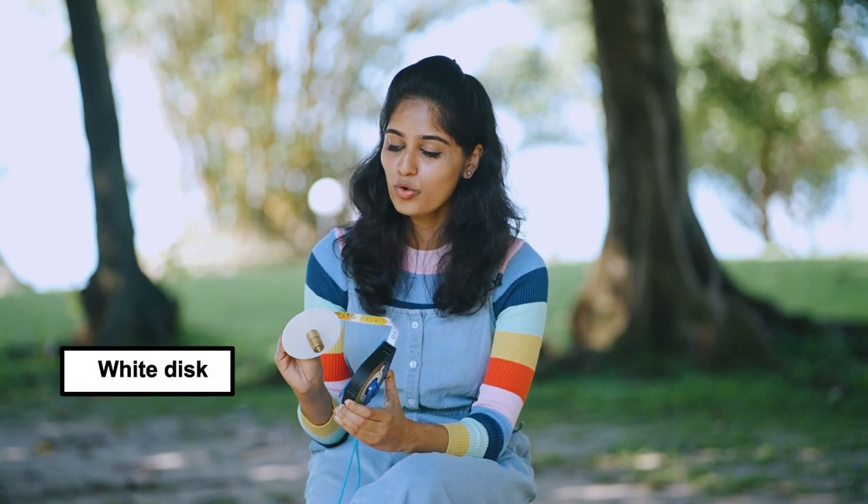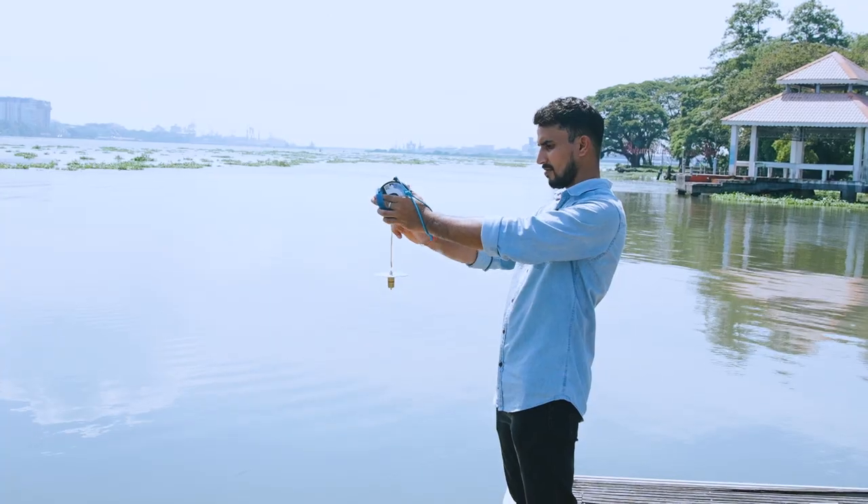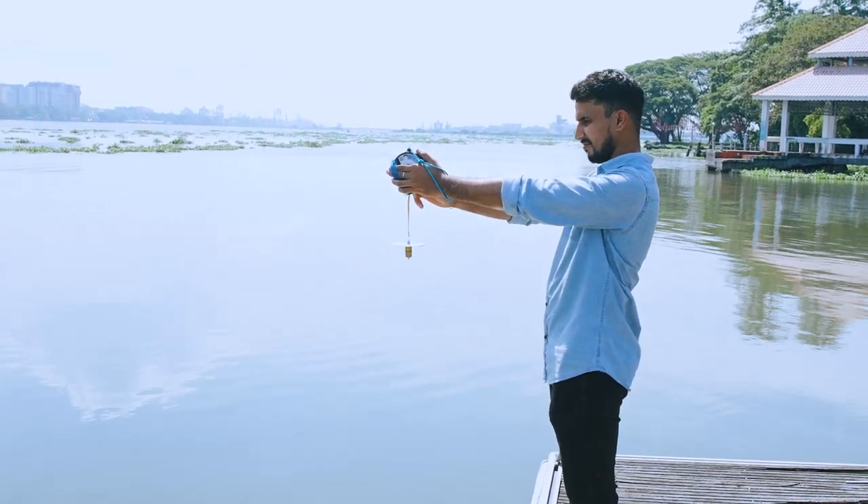The mini circuit disc has a white disc that is lowered into the water. The depth at which it disappears and reappears is locked in to find the Secchi depth, and this depth is proportional to the clarity or transparency of water. The Forel-Ule color scale is used to classify the color of the water — it consists of 21 colors ranging from blue to green to yellow to brown.